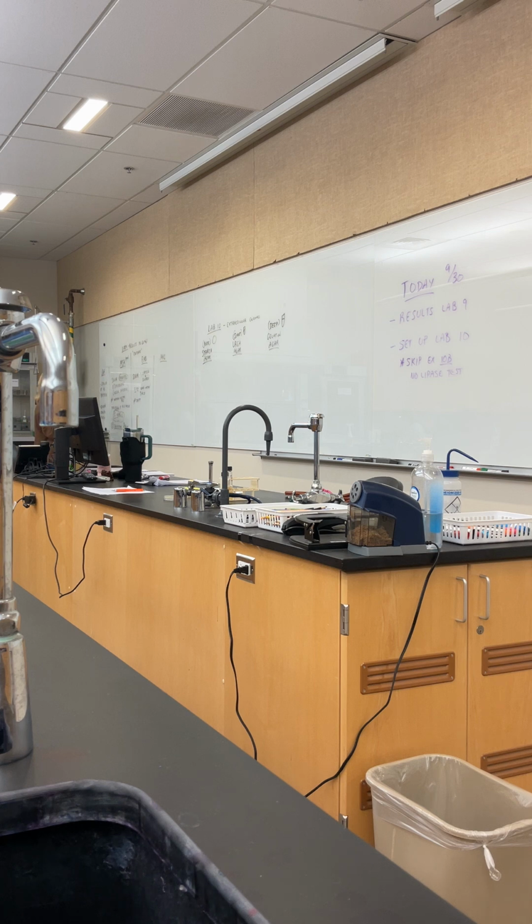And in this case, we're going to be using our eosin as one of our pH shifters, which is in the name, eosin methylene blue. That eosin is going to detect when there's a shift, and it's actually going to create kind of a metallic look. It creates a metallic colony appearance. So when you look at your plates, does somebody have kind of a pretty metallic look? Yeah, which one is metallic looking? E. coli. E. coli, good. So that E. coli, who loves lactose, produces a lot of acid. And because of that, we get this really cool metallic shift.